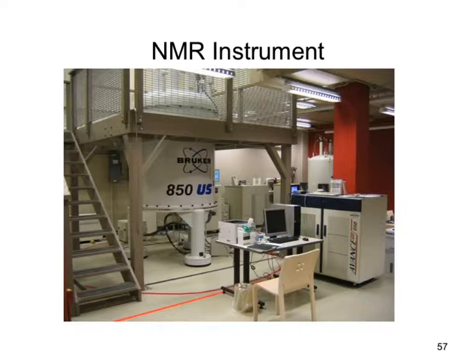That's really expensive. And that's not just the instrument. I have to have a magnet that's that strong. Okay? How strong is that magnet? See this red line right here? That nice flat one? Okay? That line means don't cross if you have any metal on your person. That next one means you will die.